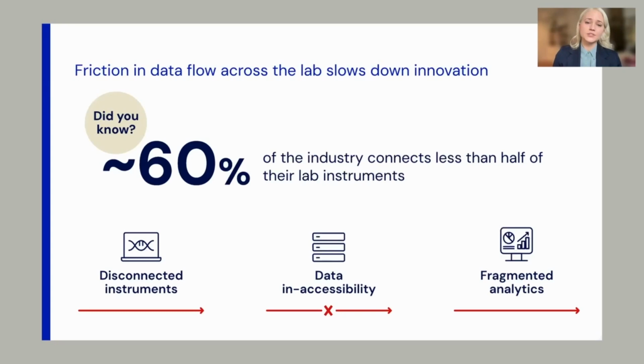which has to do with data inaccessibility. So if your data is locked on a device, obviously, and you have to manually get it, then that means that no one else has access to that device unless you pull it off directly and remember to do so. That by itself is difficult, but sometimes instrument vendors like to make their data formats proprietary as well. So even when you do pull the information from that device, unless you have the proper software to transform it, or if you have the right version of an operating system to open that file or whatever else, then you can't access that data because it's become proprietary.